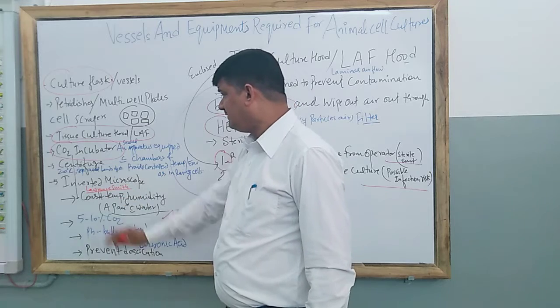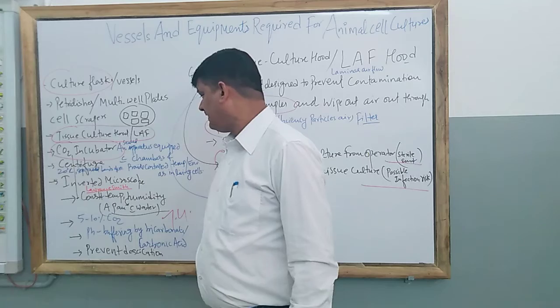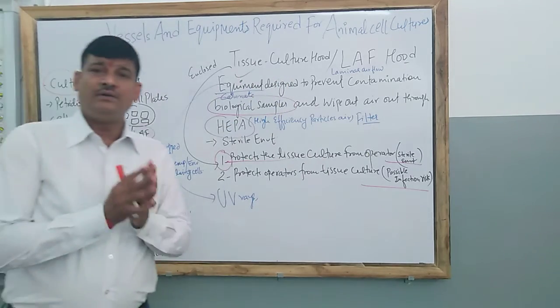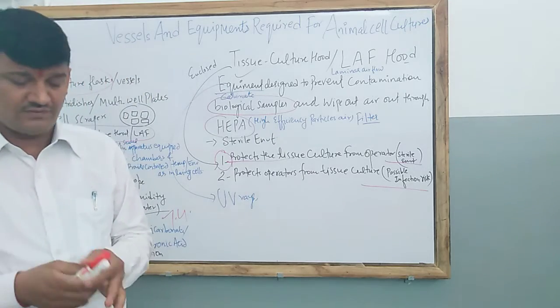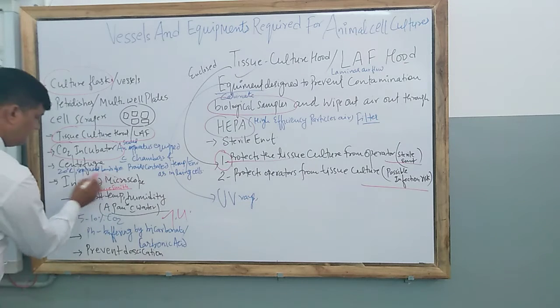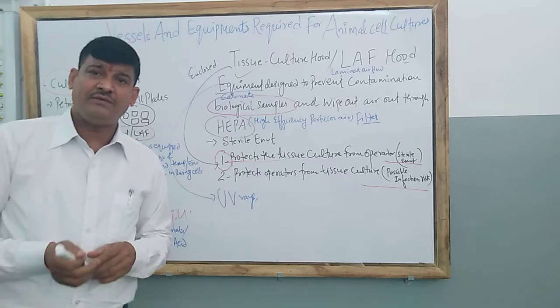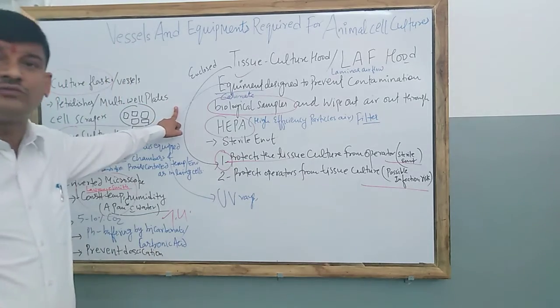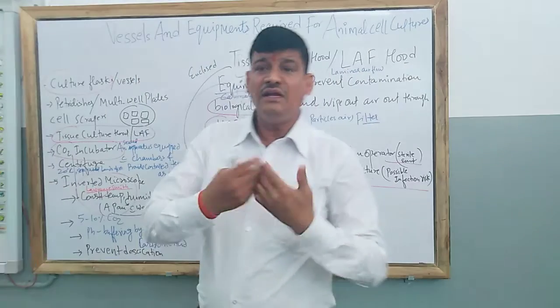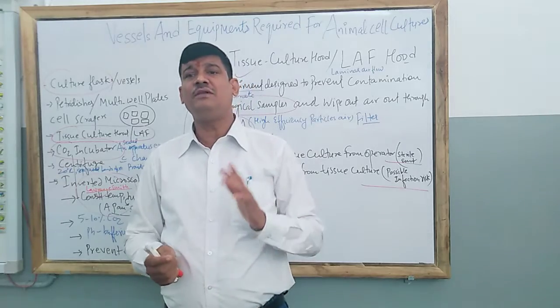Now the next one is the inverted microscope. So what is the inverted microscope? These inverted microscopes were developed by Lawrence Smith. The name is Lawrence Smith. Lawrence Smith developed this inverted microscope, and these inverted microscopes are really different from the classical microscope, that is a compound microscope or the simple microscope.